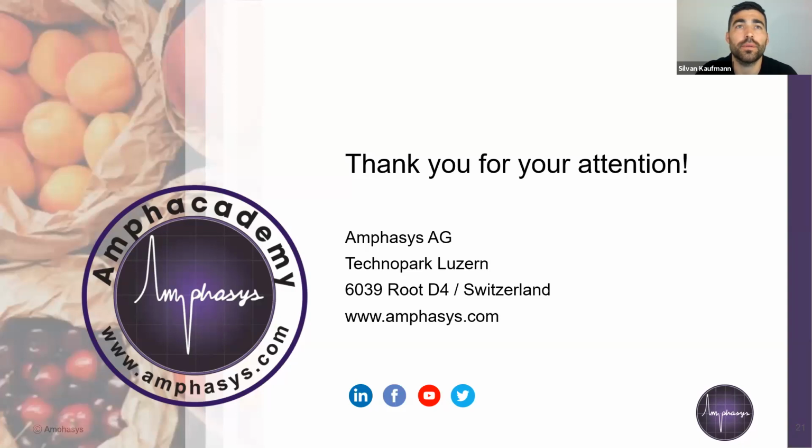Another interesting question was on the throughput of the technology. How many samples did we measure per day? We measured quite a lot. You can measure up to 200 samples or even more. It depends on how fast you are with the sample preparation. In our case, we were a little bit lower, we were not that fast, but I think we came very close to 100 measurements that we performed in the field per day.